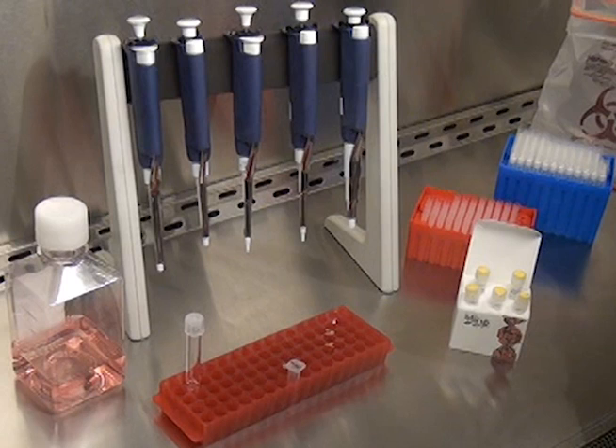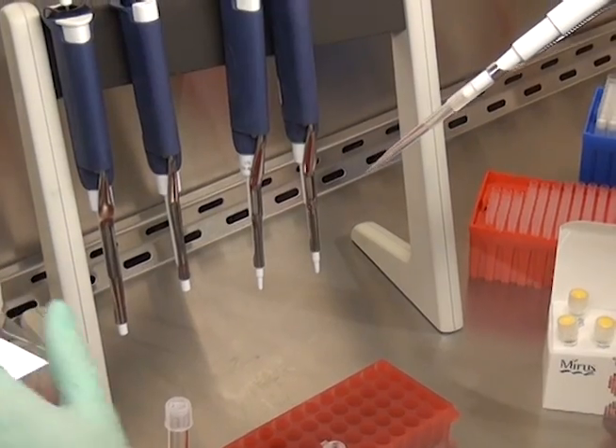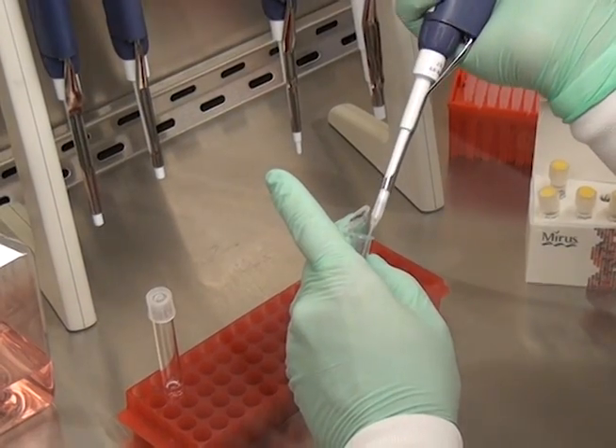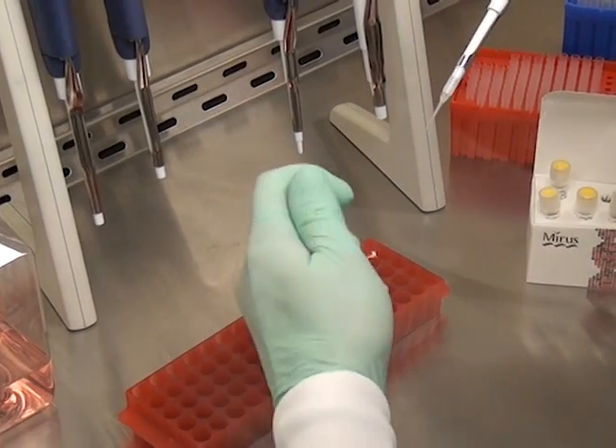The most important step in the procedure is the formation of the transfection complex. I will prepare the transfection complex in the tissue culture laminar flow hood. First, pipette 500 microliters of Serum Free Medium OptiMEM into a sterile polystyrene tube. Next, add 5 micrograms of purified DNA into the OptiMEM mix.